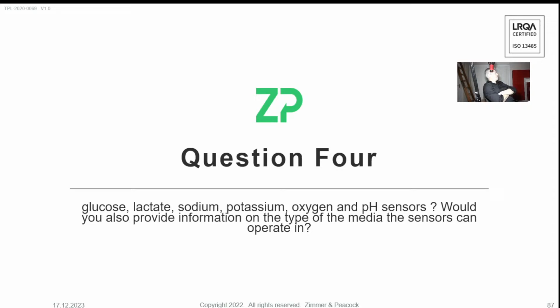Oxygen, primarily oxygen in things like cell culture, which is not the same as what we tend to do. One of the easiest ones to do it in is, we can probably do it in blood and urine. Well, urine, no, sweat. pH. We do actually have something called the calibration-free pH sensor, which might be more interesting. But pH is the most measured chemical parameter in the world. So you can measure pH in cheese, milk, blood. You know, sort of.